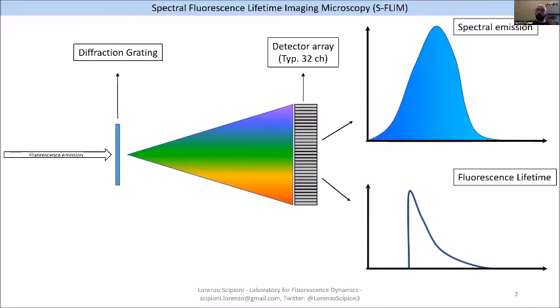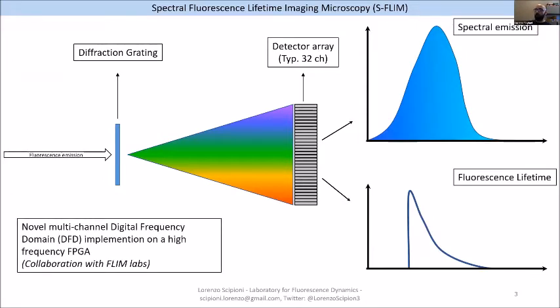acquiring the lifetime information. This was done with the new multi-channel digital frequency domain implementation based on FPGAs that was done in collaboration with FLIM Labs.